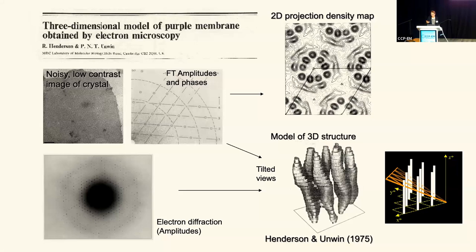And that triggered the idea that, if you could really get these methods to work better, you could look at structures of proteins, structures of macromolecules. So that was quite spectacular. And they did tilts and got it to 3D. Now, I should say, doing a tilt series on photographic film is not for the faint-hearted. Most of you, I think, couldn't imagine how ridiculous that was.